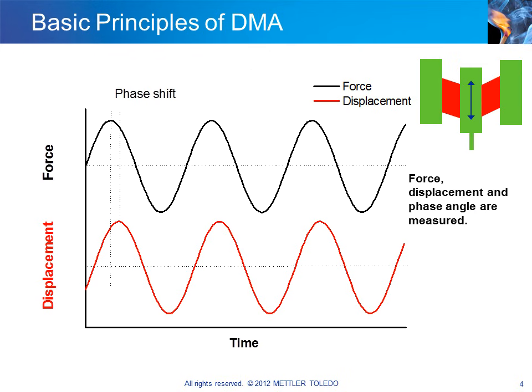Now let me explain the shear measurement mode. The sample holder is shown schematically in the red and green diagram in the upper right-hand corner of the slide. In this mode, 2 identical test specimens are held between 3 discs that are clamped together to form a sample holder. The middle disc is moved up and down under instrument control.